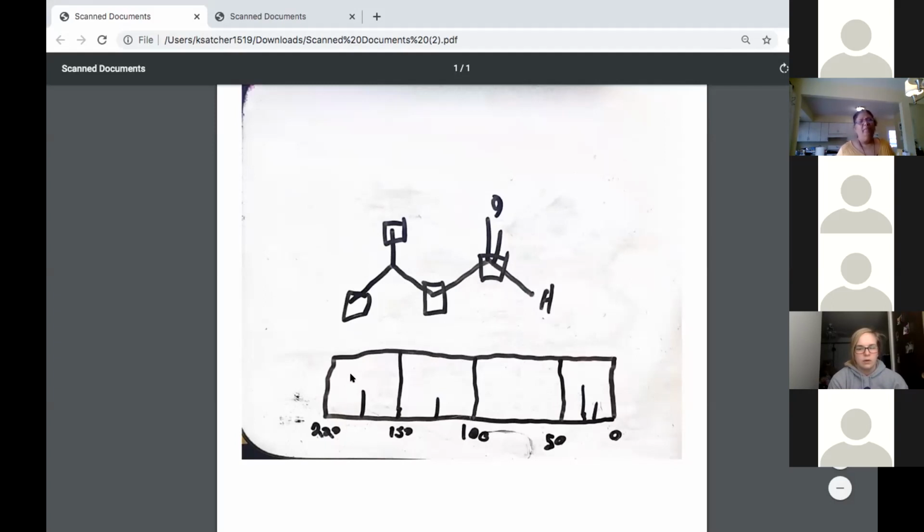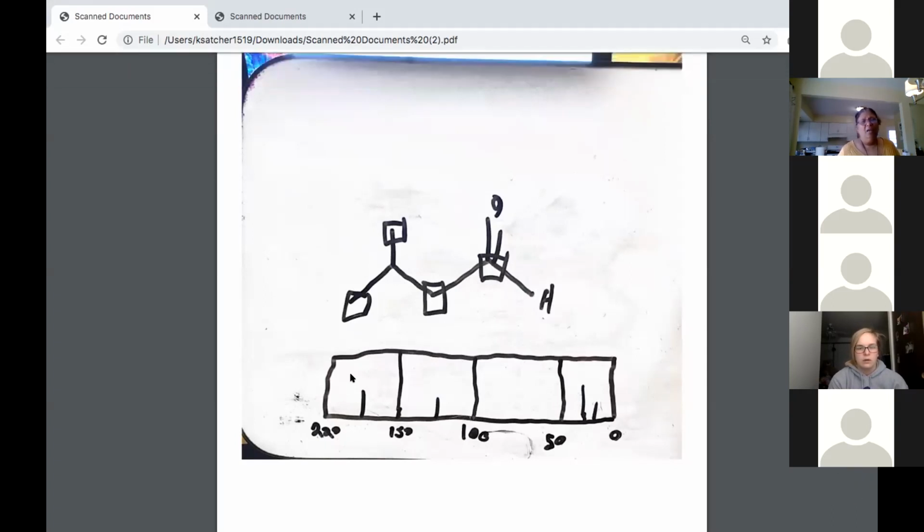KJ, I'm not sure if that's going to be cis or trans because there's no double bond there. You see that? Remember conformations, Newman projections, you can have free rotation about that carbon. So that's connecting the 2 methyls that you've drawn. I think they're going to be equivalent. If you had a double bond there, then definitely you'd get cis and trans. It makes sense. If it's not a double bond, then they're equal. Got it.